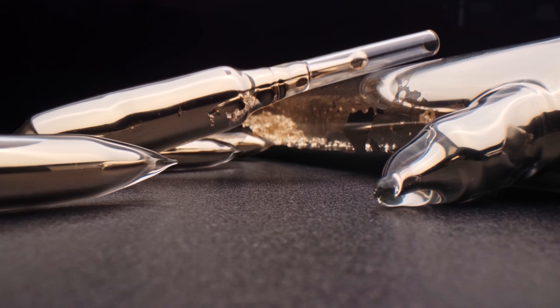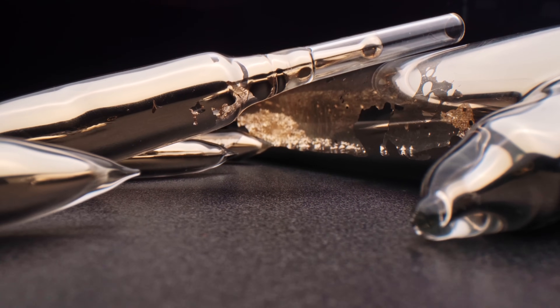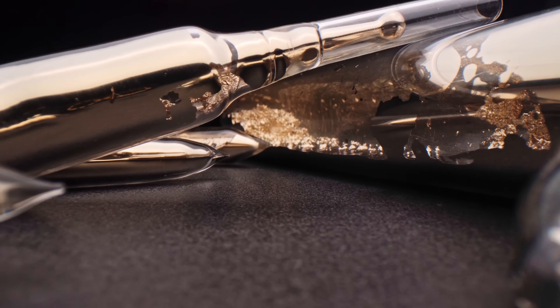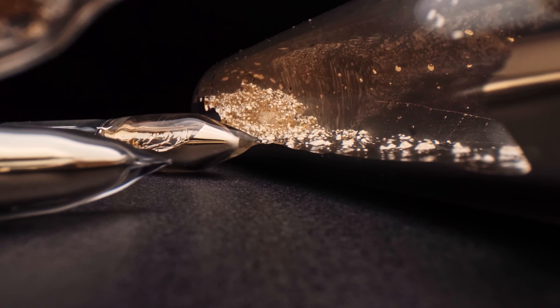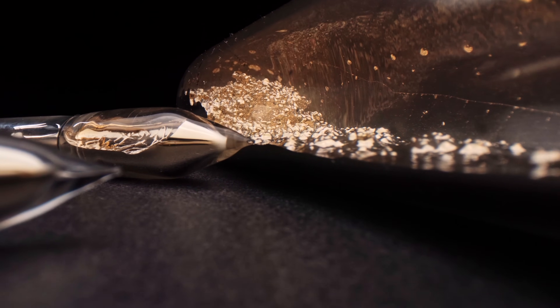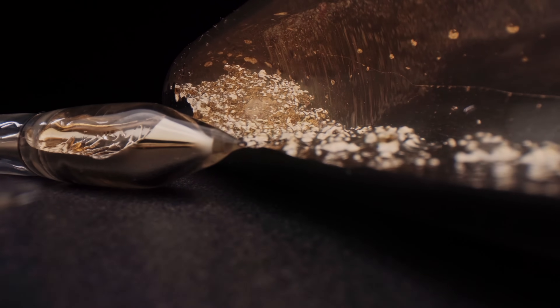If sodium and potassium are usually stored under a layer of mineral oil, then the other two most active alkali metals – rubidium and cesium – are stored in glass ampoules. In this video, I'll break these ampoules and mix both of these elements to see what the rubidium-cesium alloy is like.